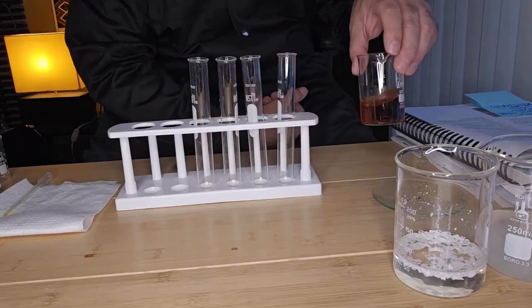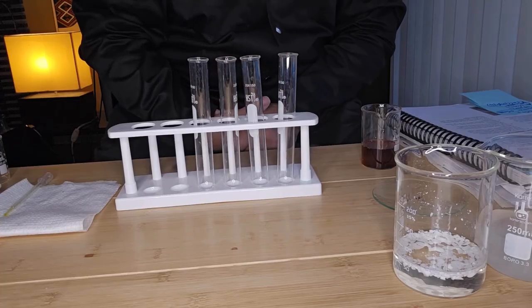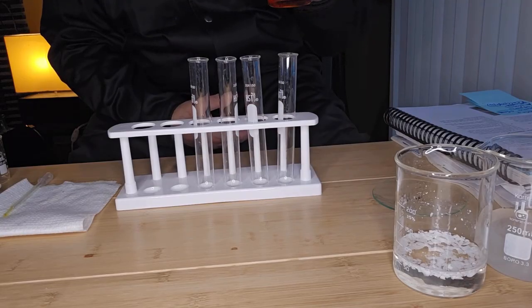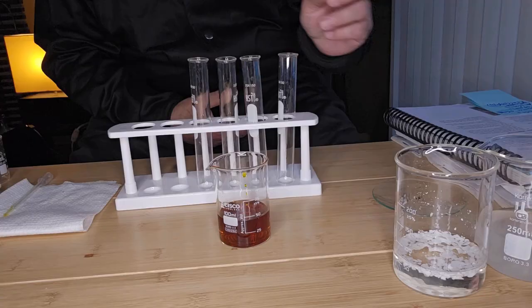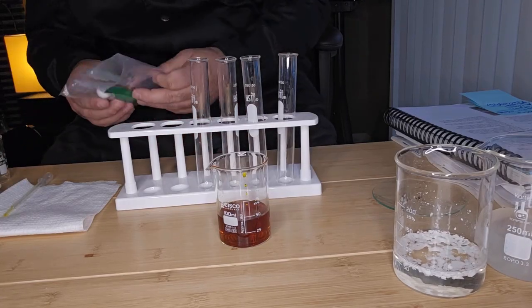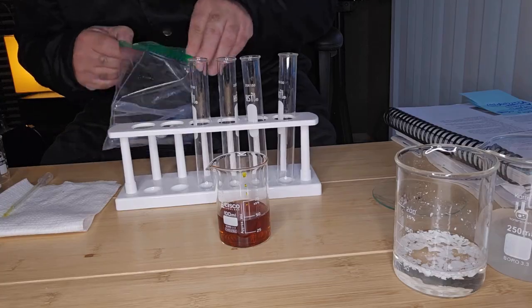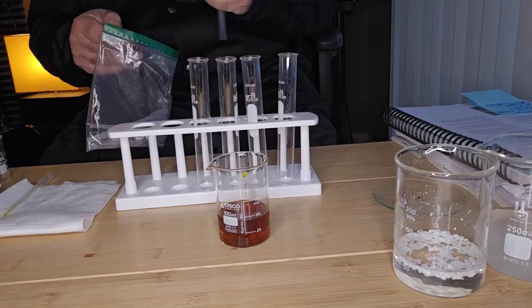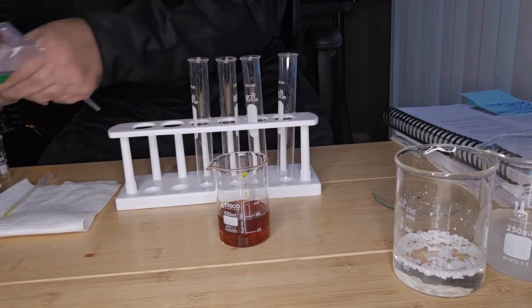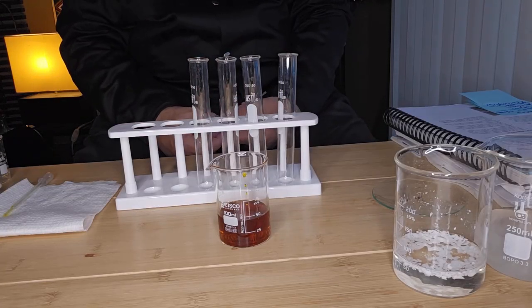What I'm going to do is add 1 mL of 30% iron chloride to the boiling water, and I'm going to stir that. Let me get a stirrer if I have one. Okay, I'll just use a pipette, it's fine. I'm just letting the water boil.